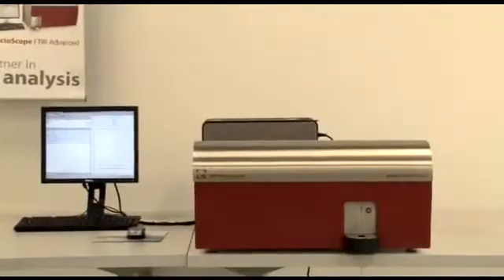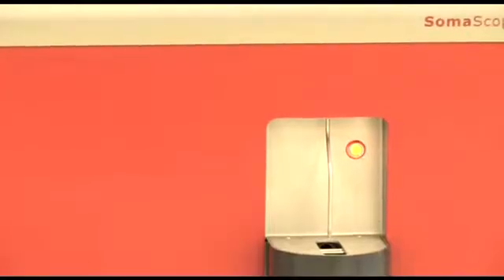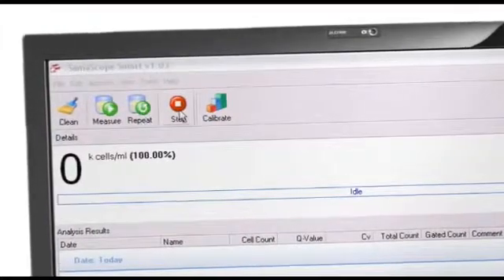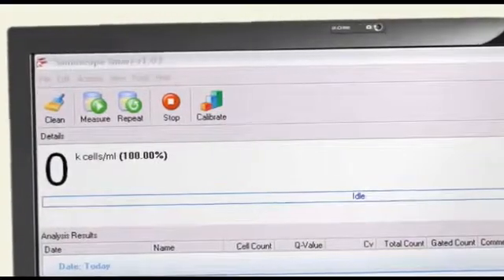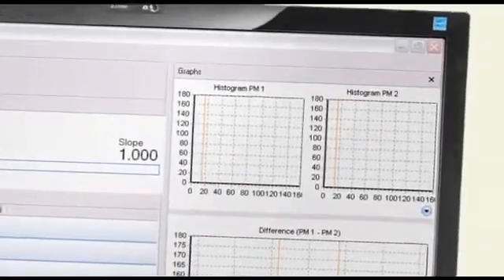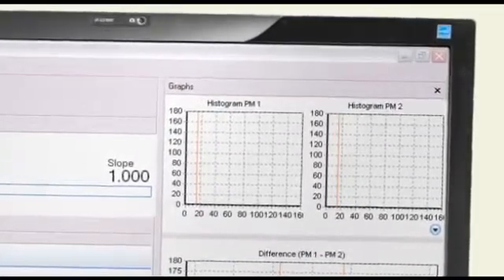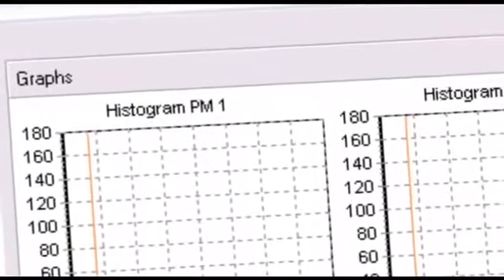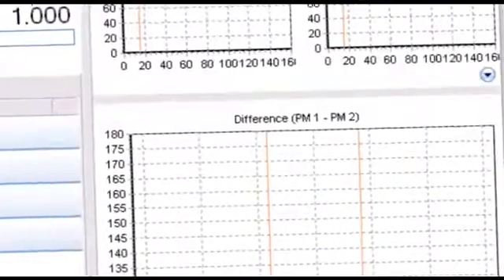When the instrument is switched on, a red light appears. A clear overview of all command actions for analysis, cleaning and calibration are shown on screen. The actual graphics of the somatic cell count measurements are displayed on the right. In the graphics, you see the results of photomultipliers 1 and 2 and a combined overview in order to compare the differences.